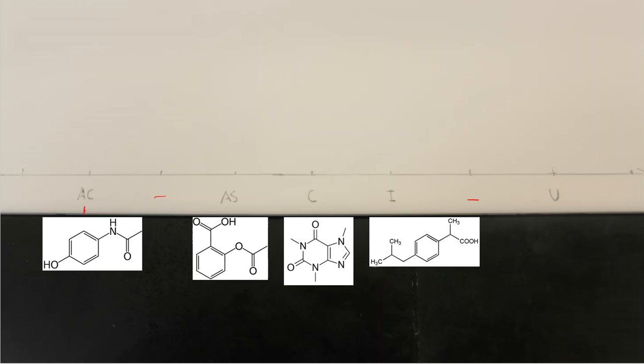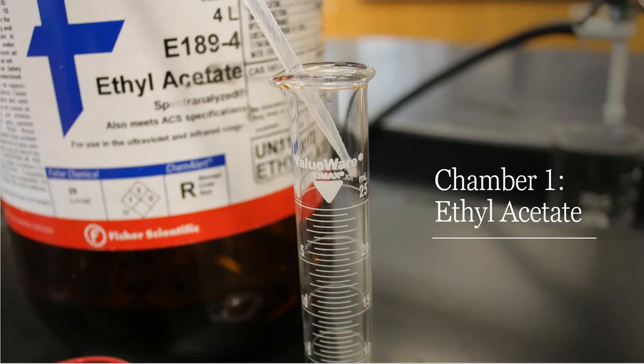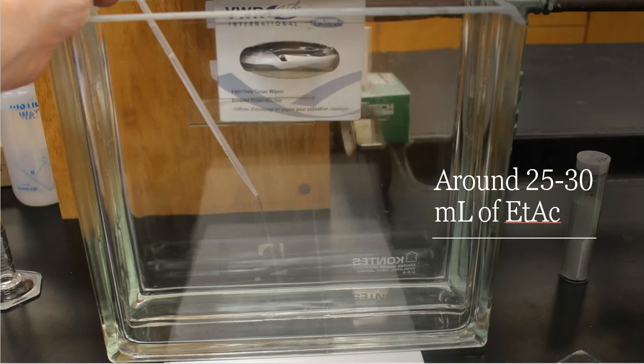All right. So in the very first chamber, ethyl acetate. So I just took a graduated cylinder. I just filled it full of ethyl acetate. These tanks typically do not take more than 20 to 30 mils of ethyl acetate in total. So I just transferred that into my TLC tank or my TLC chamber, and you just need a little bit in the bottom. 20 to 30 mils, it will go a long way. That will be plenty enough for your plate to suck all of that up. So this is not an issue at all.